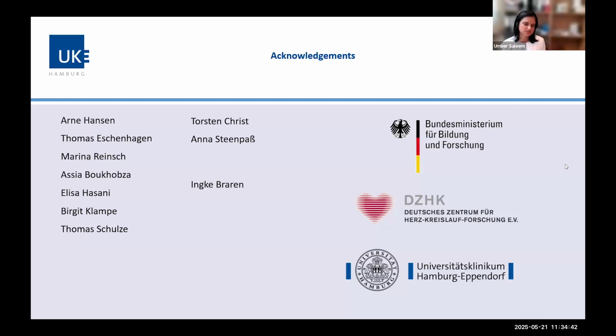So actually, we initially used a 10x objective to focus on a part of the tissue, but then there was a lot of motion artifact, and then we used a 2x objective, and still there was motion artifact. So we then increased the region of EHT, and now the light from the whole tissue is being observed and then converted by the PMT into an electrical signal.